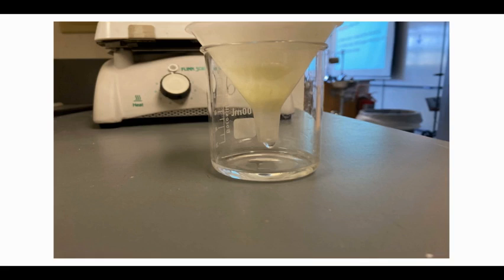Here's a close-up of your final filtration. You see a clear liquid that is dripped out through the bottom of the filter paper and a yellow powder that has stayed on top of the filter paper.